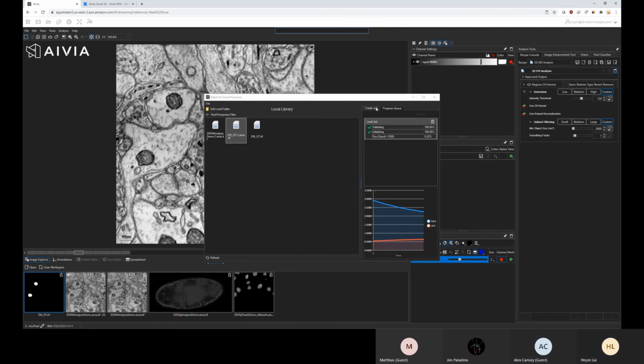Okay, that's good to know. But the 16 slices requirement is definitely something that I did not realize before. Yeah. So for training the 3D, you will need the 16 slices. But if you just want to try it with the 2D model, having less than 16 slices will also work.